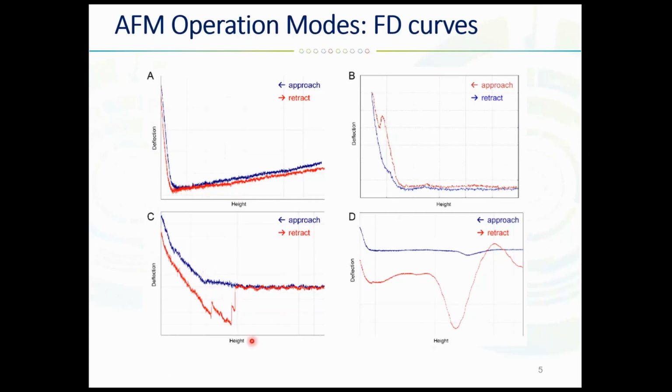On the C plot here, you can see so-called multiple pull-off events, and they are of different sizes because the peaks are at a bit different heights. This particular curve can be measured in an experiment when you are interested in cell-to-cell adhesion, and this curve reflects how the receptor pairs between cells are breaking during the retraction part of the measurement.